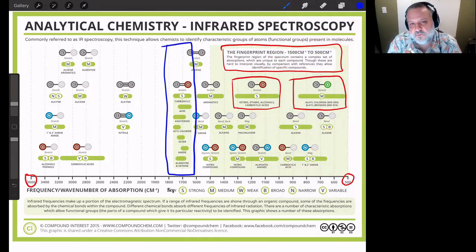It's the CO stretch. If there's anything you do in your first part of organic chemistry, it's learning to identify the CO stretch in any IR spectrum. It's like a loud 1980s glow dye highlighter color neon sign that you just can't miss. And that's what you'll see. And we'll see that in a second.